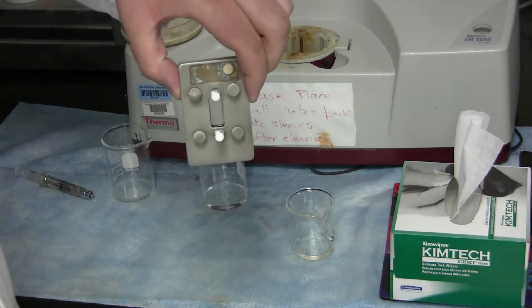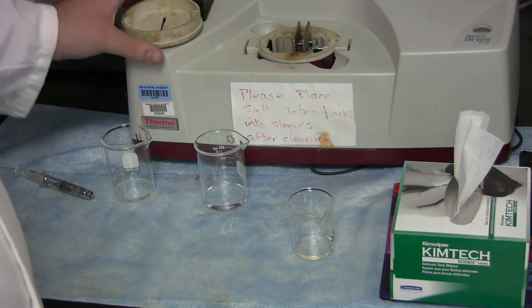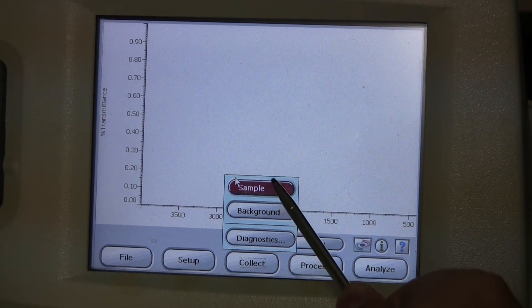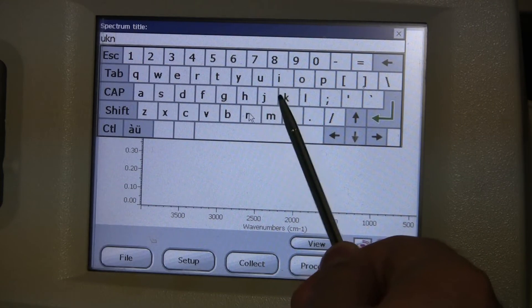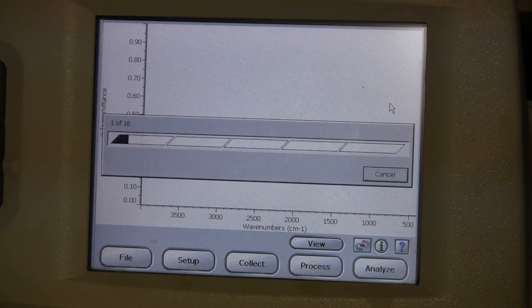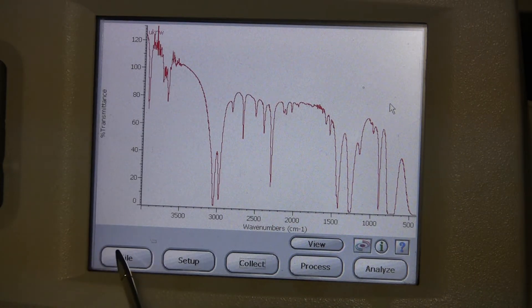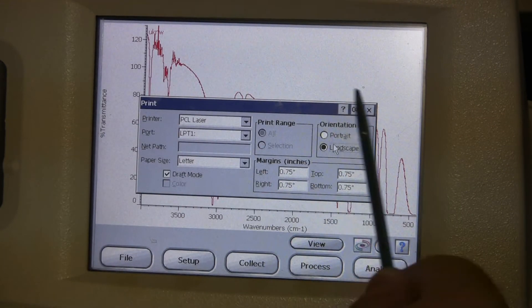Take your solution cell and place it into the Nicolette machine. Make sure to place the cap on top. Now go to Collect and Sample. Type in anything you want and then click OK. Wait for the scans. Then as before, go to File, Print, change it to landscape, and hit OK.